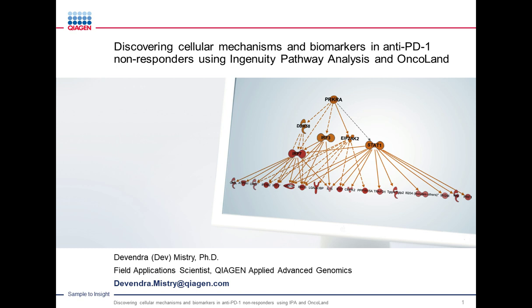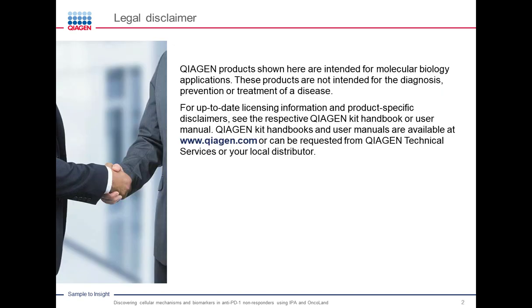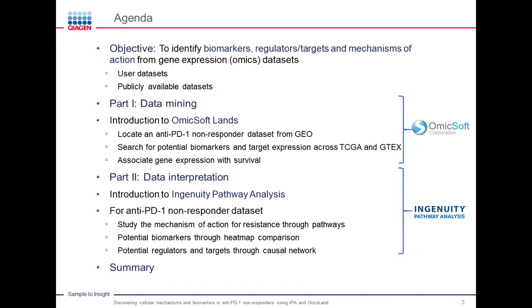Thank you, Xavier. In this presentation, we're going to talk about how Ingenuity Pathway Analysis software and OncoLand software can be used in combination to discover cellular mechanisms and biomarkers in an anti-PD1 non-responder dataset. Just a quick legal disclaimer: the products I'm going to show you are meant for discovery purposes as opposed to diagnostic purposes.